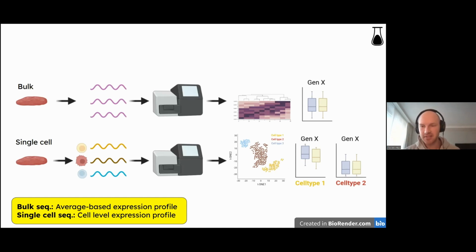And now you might see, based on the cell types, that this particular gene in healthy and non-healthy is different for a particular cell type, or even between different cell types, which gives you now a better understanding about the mechanistics of this tumor, and also the cell composition of this tumor, and therefore leads to possibly new target or therapy discoveries.